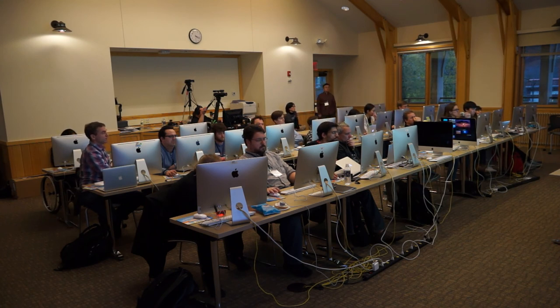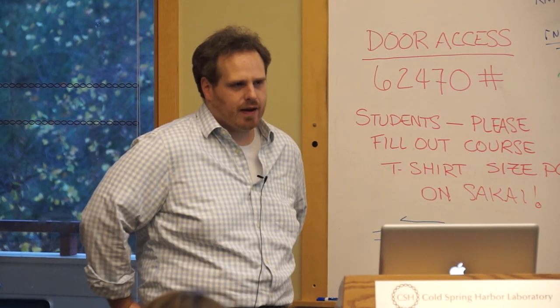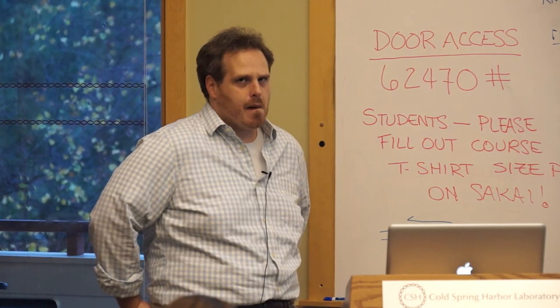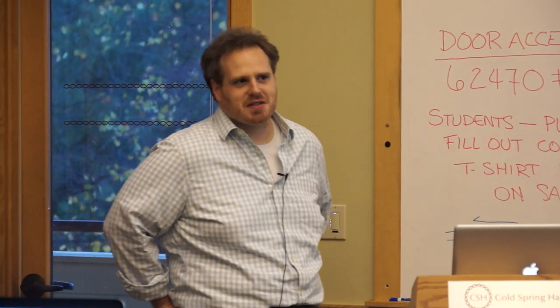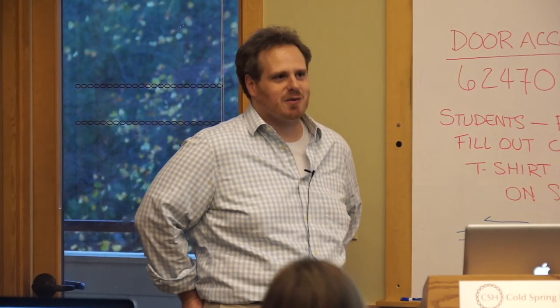Yeah, so a couple key points. I've been a big fan of PacBio sequencing. How do I put this? If we imagine we're 100 years in the future, my prediction is there'll basically only be long read sequencing. Either the PacBio chemistry will be working really well, or the nanopore technology will be working really well.